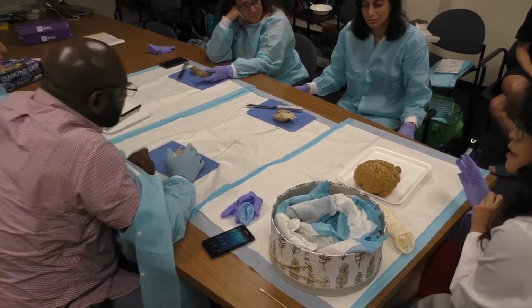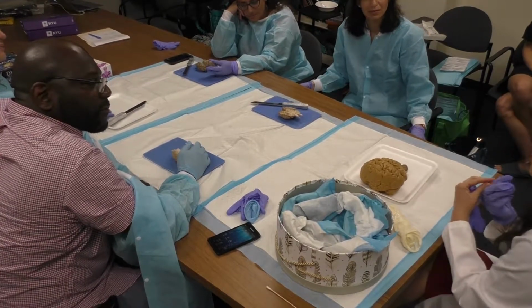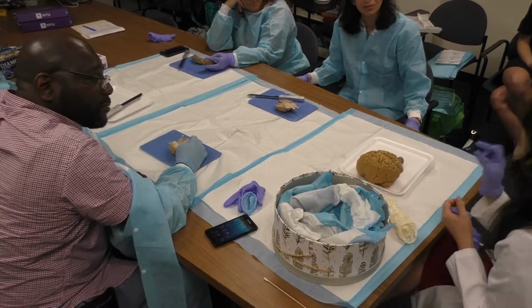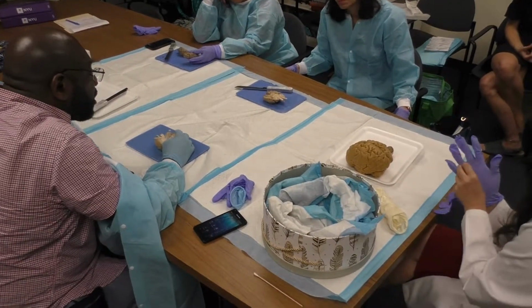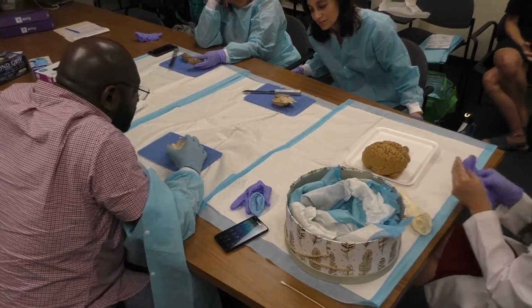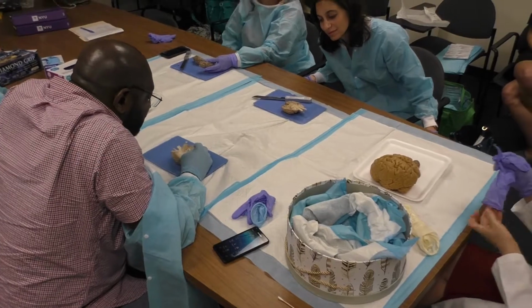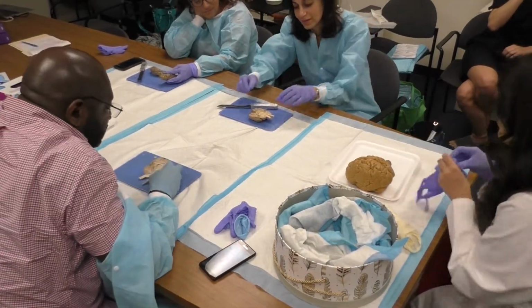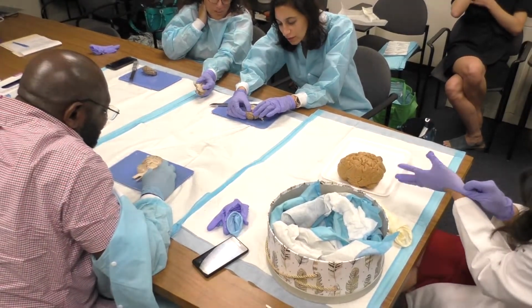Pineal gland. It's the only structure that is singular in the whole brain. And so they thought, oh my God, look, everything has a double except for this, so it must be the seed of the soul. Of course, that's not true, but even though it kind of looks double here, if you didn't cut straight through the middle, you'd get a whole little nugget.